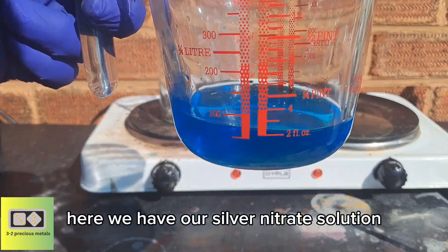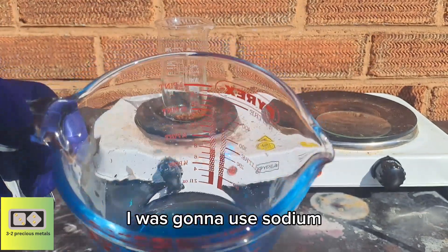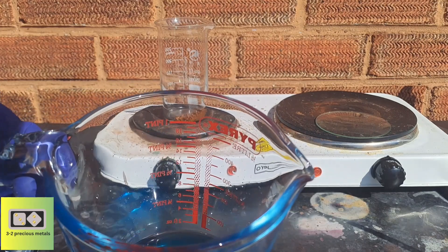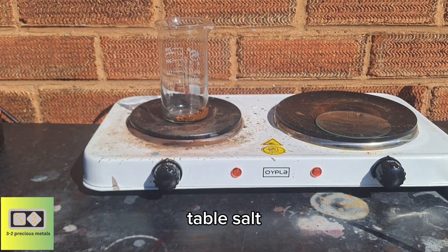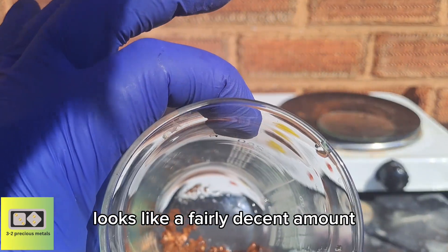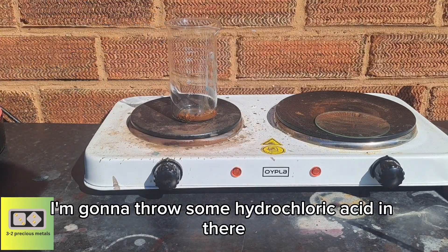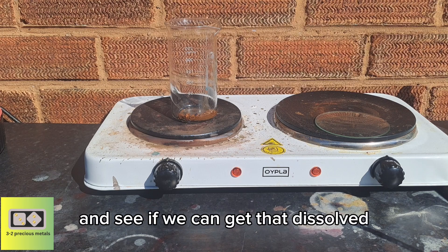So here we have our silver nitrate solution. I was going to use hydrochloric acid but I think I'm going to use some table salt instead. And here we have the remaining gold — looks like a fairly decent amount. I'm going to throw some hydrochloric acid in there and some potassium nitrate and see if we can get that dissolved.